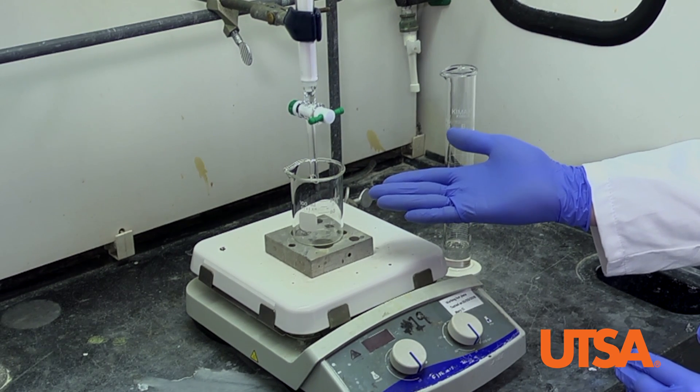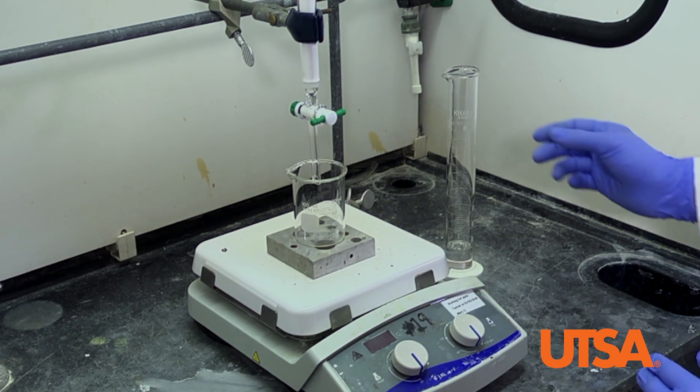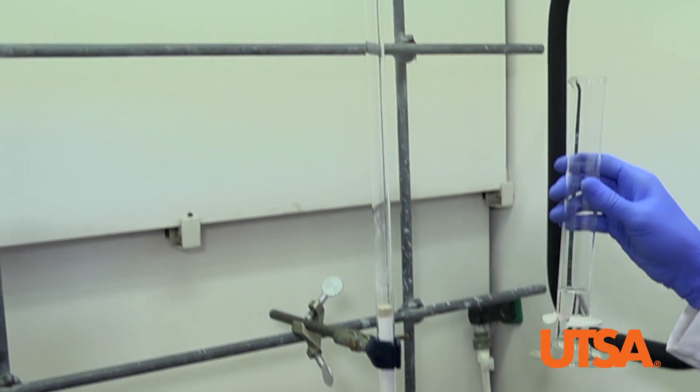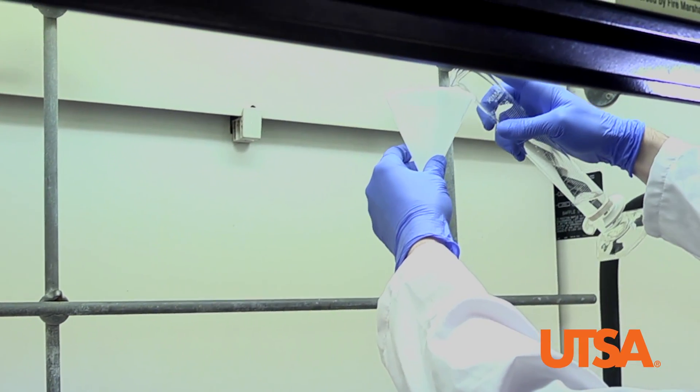Make sure you have an Erlenmeyer flask beneath the column and then slowly pour 25 milliliters of petroleum ether. Petroleum ether is used to wash the walls of the column.